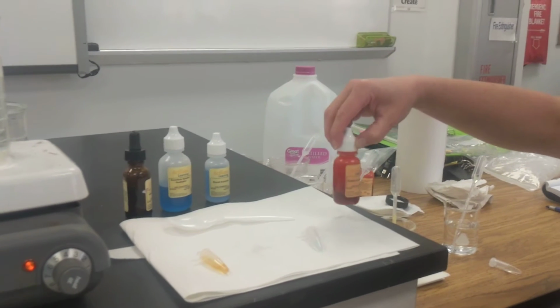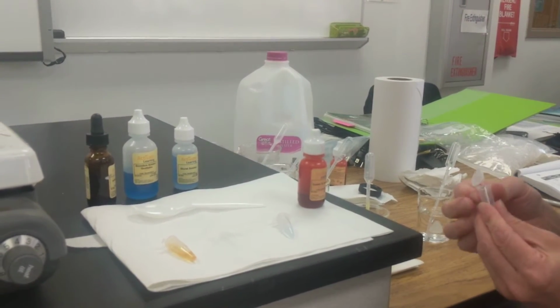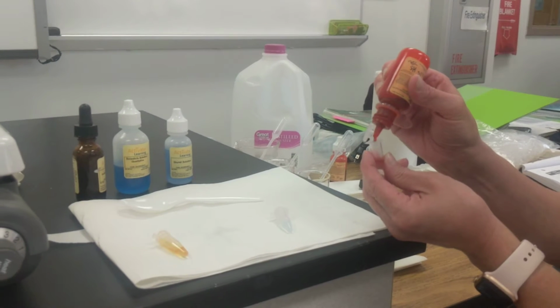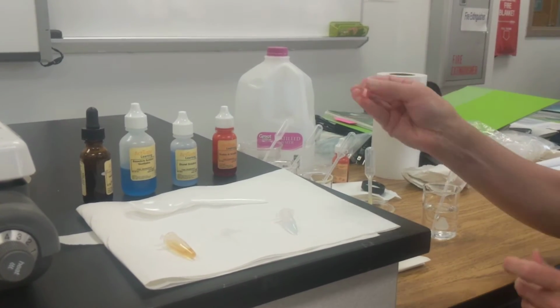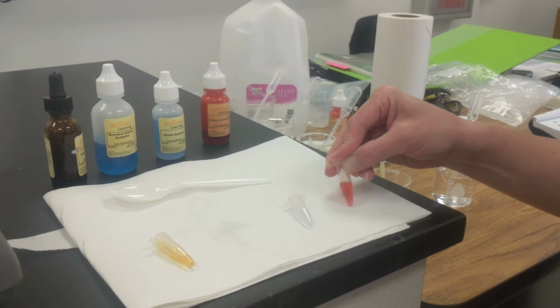All right, our last one is the Sudan test. We're testing for fat in water. Go ahead and put a couple drops in there. Little dab will do ya. Yep. All right, and that's looking like the dull maroon color.